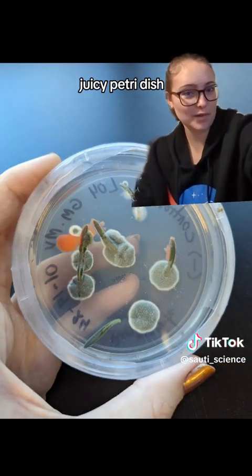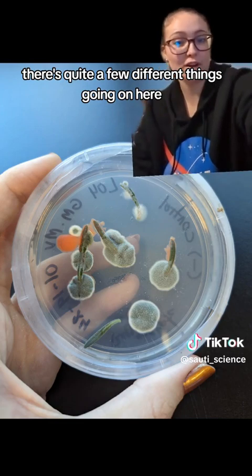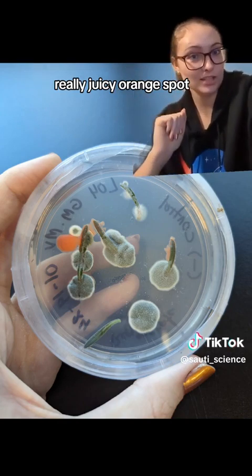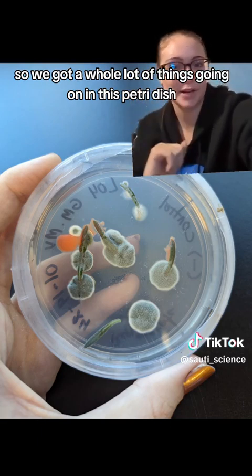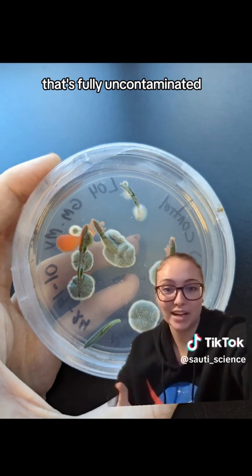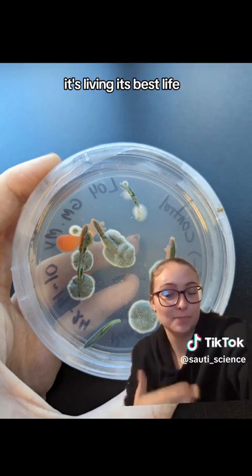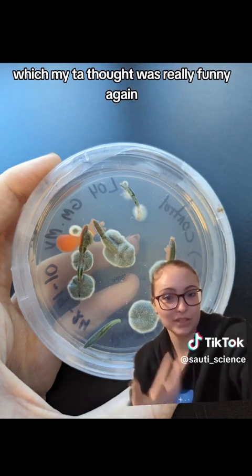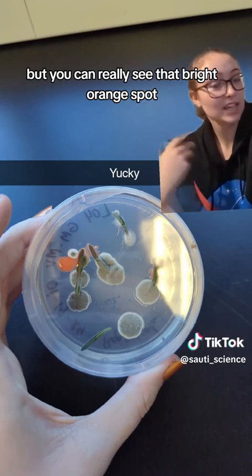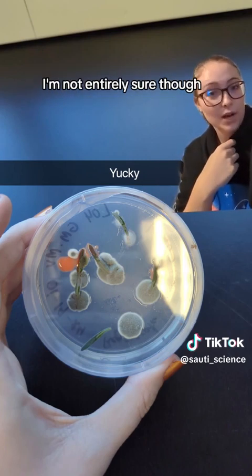Next we have this really juicy petri dish. This again was the negative control, so there's supposed to be contamination there. There's quite a few different things going on: a fuzzy-ish green mold, a really fluffy white mold, and a really juicy orange spot. What's funny though is that at the very bottom there's a lavender leaf that's fully uncontaminated — all the rest of the leaves have something growing on them, but that one is just fine. It's not contaminated at all, which my TA thought was really funny. The fuzzy ones are probably fungal and the juicy orange one is probably bacteria.